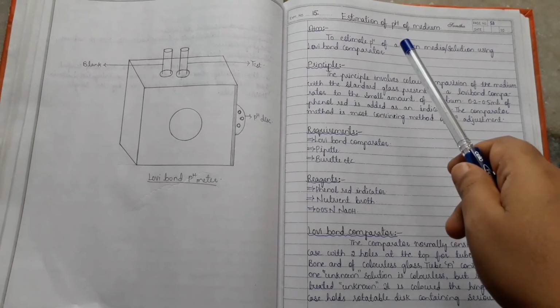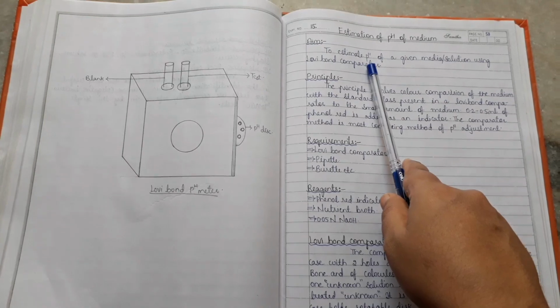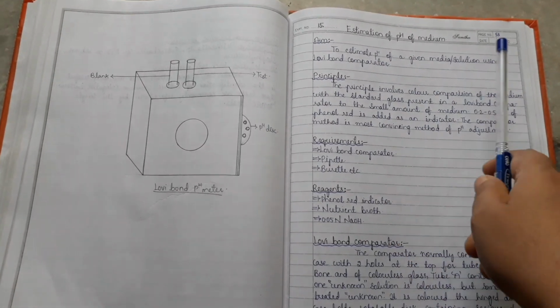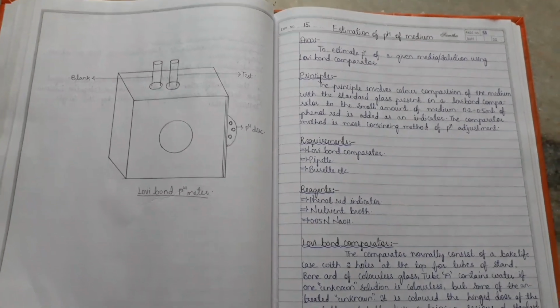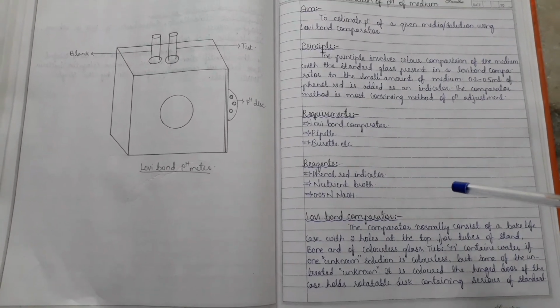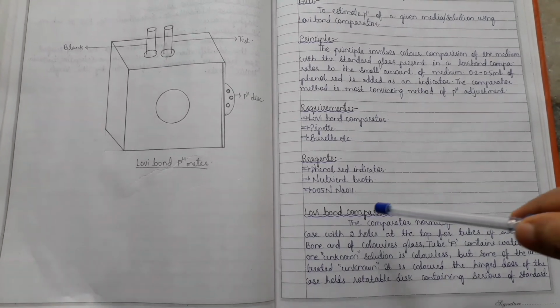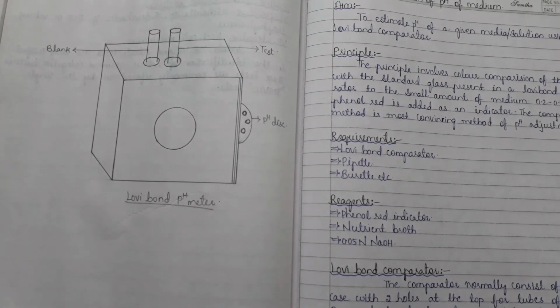So estimation of pH of medium, the 15th one, is to estimate the pH of a given medium or solution using a Lovibond comparator. So yeah, this is the principle and about the Lovibond comparator. Yeah, this is the picture for that.